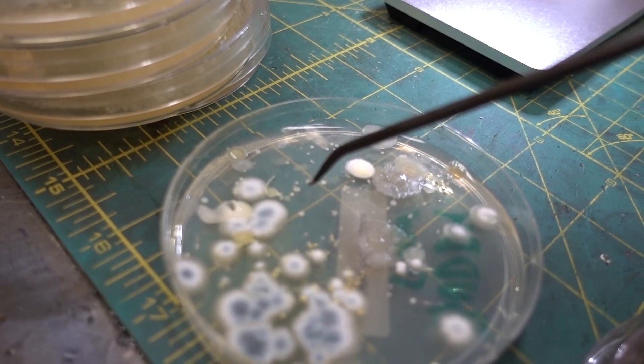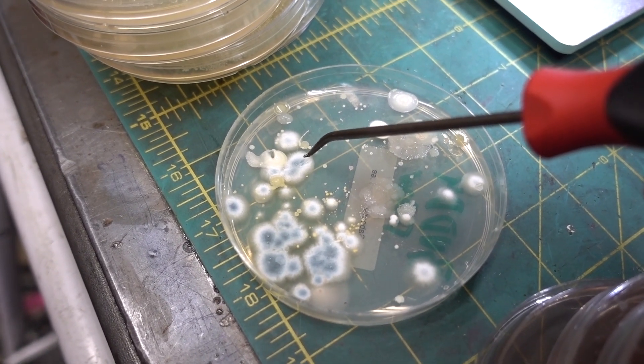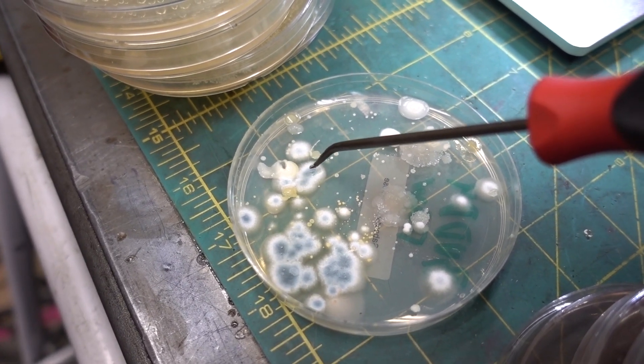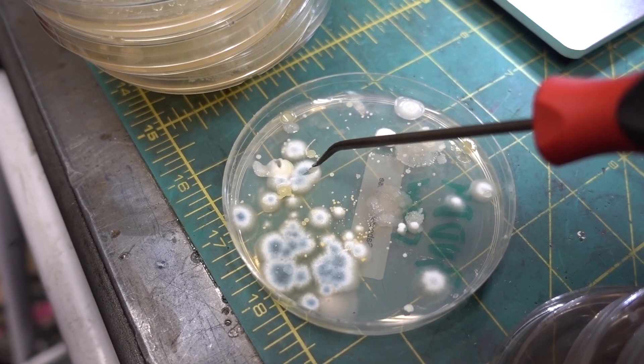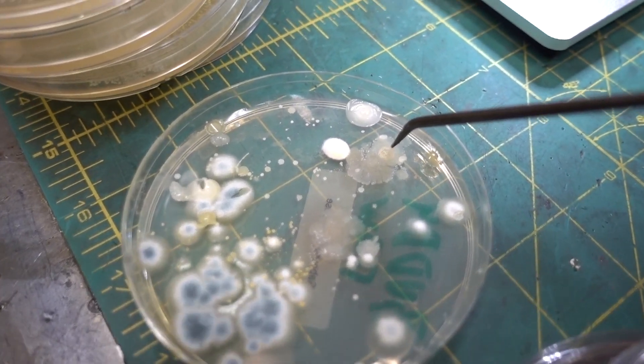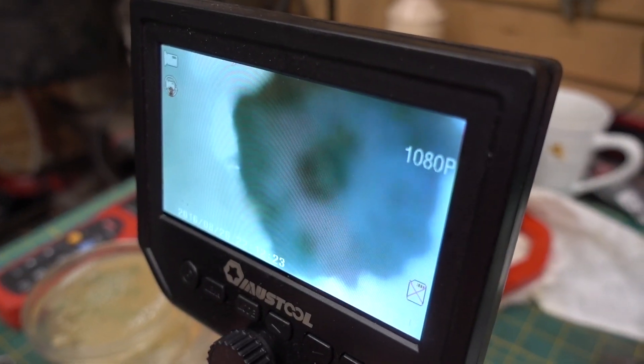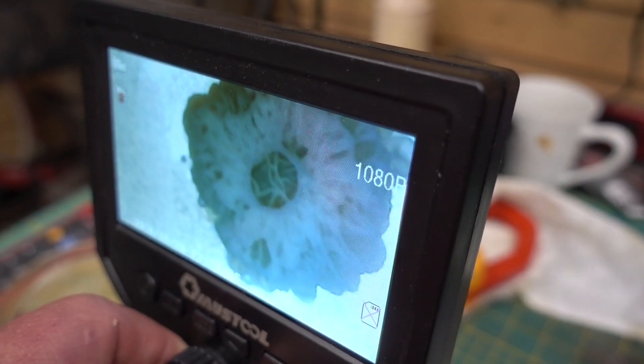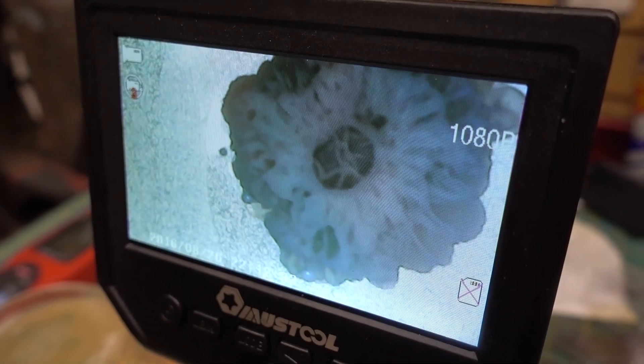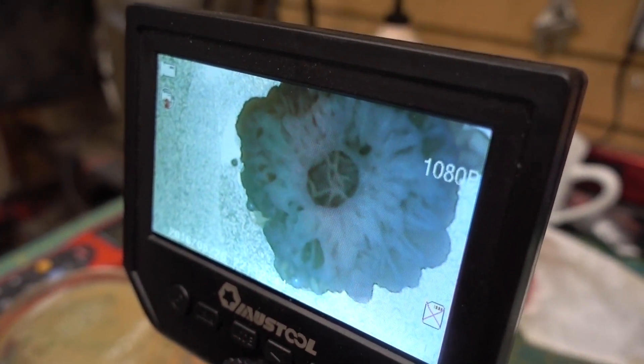Now not all E. coli are bad for you. Some of them are bad for you. But you definitely have them in your GI tract. That means in your belly. They help you digest things. Now let's get on to this one. This is Buddy's paw. What do you think this fuzzy stuff is? I think it is E. coli. Are you saying E. coli because it's the easiest to say? Yeah. This is fungus. Fungus amungus. Hey, you're poking it too hard! What do you think this is? This is an interesting one. Candida. You can tell because it's got a brainy look. How did I ever get Candida on my hands? Well, it lives in your body. Is it good for your body? It's okay for your body as long as it doesn't get out of control. Like if you're sick or you're too tired. And then it takes over and makes you sick. But normally it's fine.